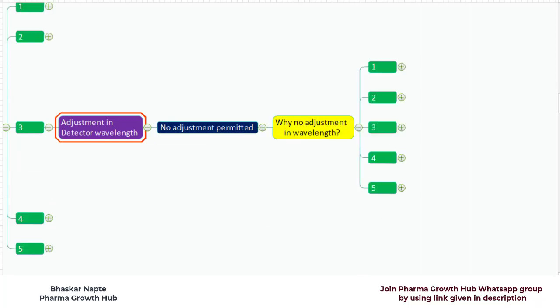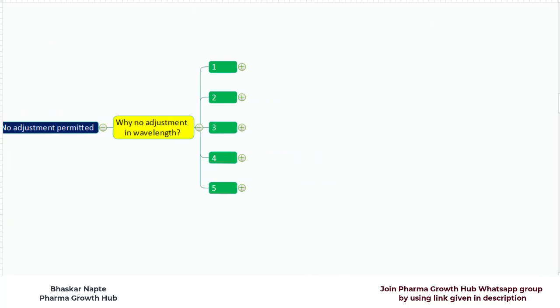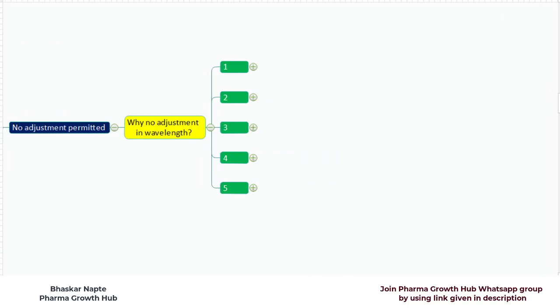Let us understand with the help of these 5 important points why USP 621 General Chapter does not allow any variation into the detection wavelength. The first point is: interested compound may go missing because of change in the detection wavelength.